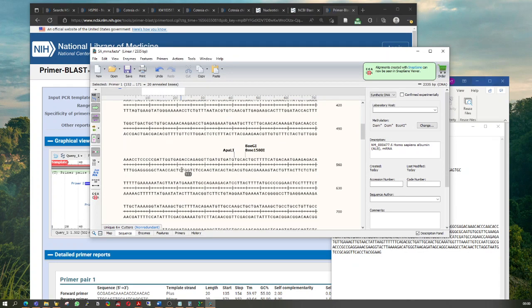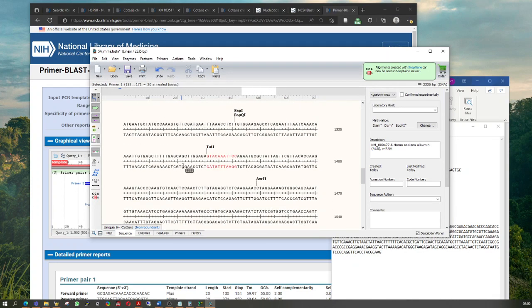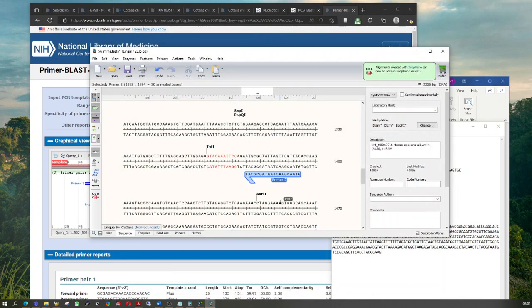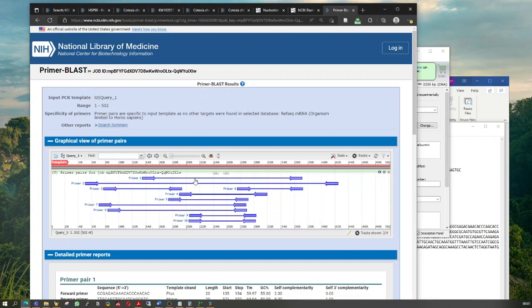Then you have primers. For your reverse, you can also do the same. I look at my melting temperature, I'm very happy. 20 base pairs. I can also let that one go this way. I should add primers. Bottom strand, of course, the GC content is 40, and I add primers. So this is one of the easiest and quickest ways to add primers as well.